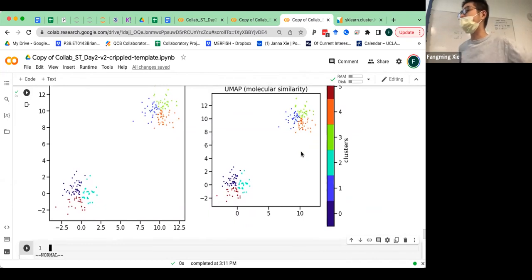So that's actually a general caveat of applying clustering algorithm. You need to know a priori what's the diversity inside your data set, and you kind of need to test through a lot of things to see what makes the best sense to your data. Unfortunately, in reality, the things almost always don't go clear cut like this, in which you immediately can eyeball it and see there are only two clouds. But yeah, you'll deal with it.